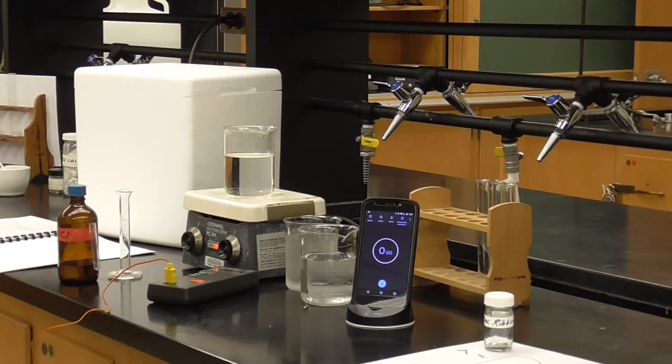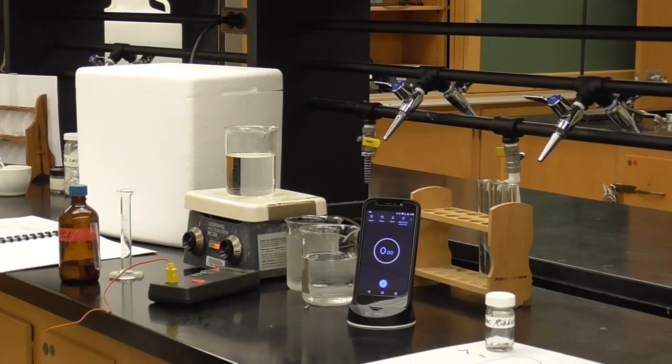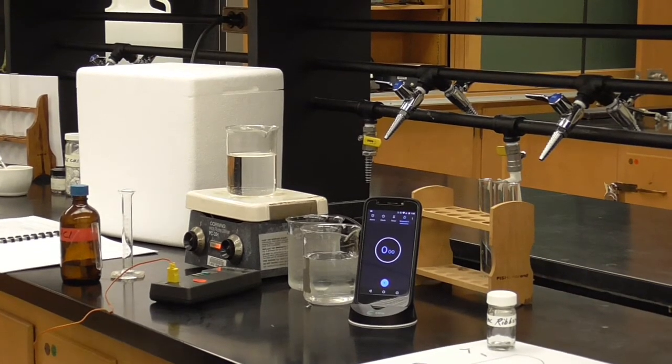Part D, we're looking at temperature now. And I gave you the rule at the very beginning, on average every 10 degrees Celsius of a hotter temperature makes the reaction go about twice as fast. And so we're going to test that and see if it works.